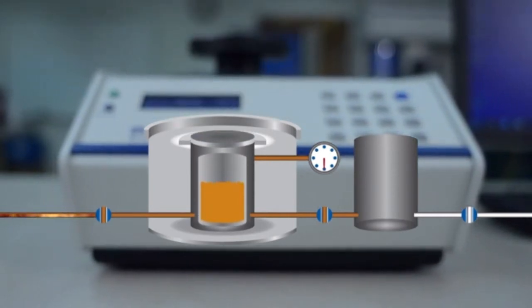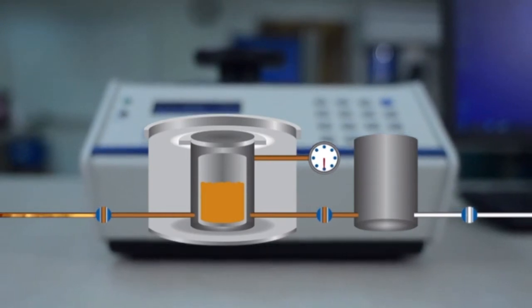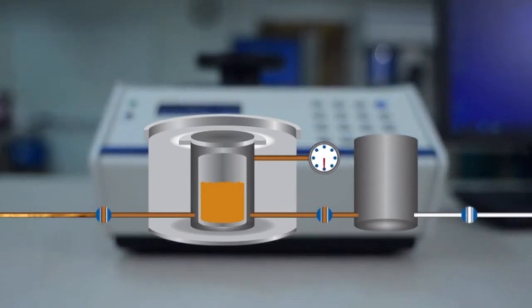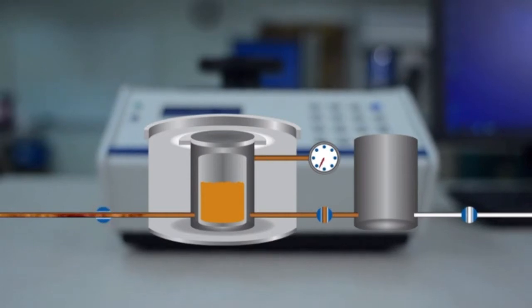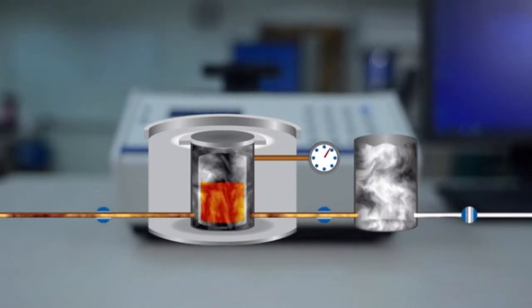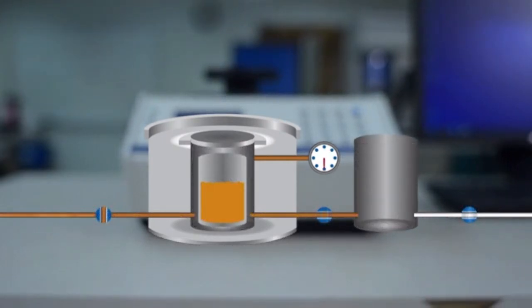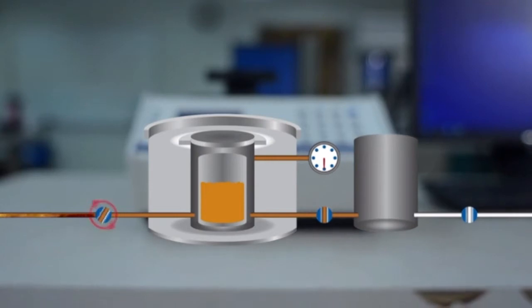We're going to pressurize the sample chamber with gas from a helium or nitrogen tank set to 22 pounds per square inch of pressure. To purge the system, open the fill valve and then the expansion valve. Then vent the gas out of the unit. Before analyzing, we purge the system using this process.